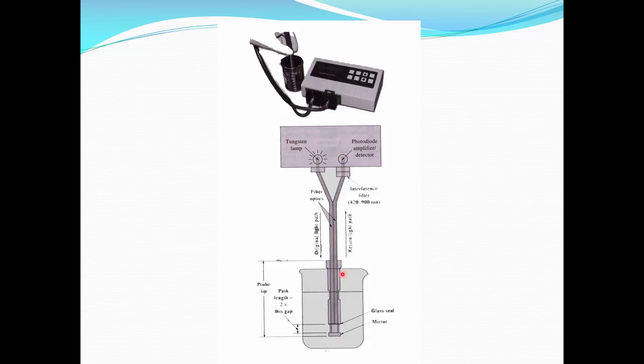It need not be necessarily in all designs. We have some amount of filter and other things also here. If necessary, we use them, otherwise for a given wavelength the photometric titration should be possible. Very comfortably one can do the titrations.